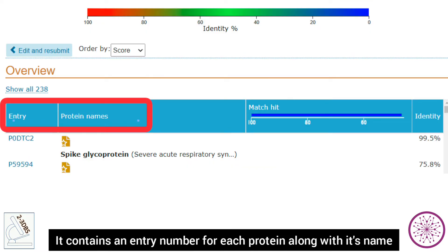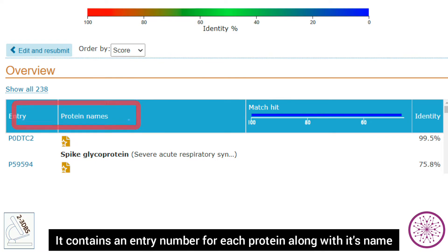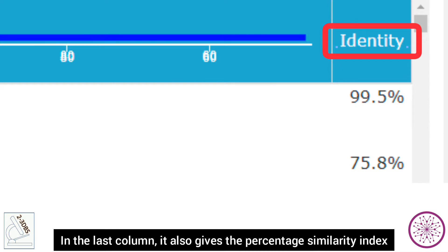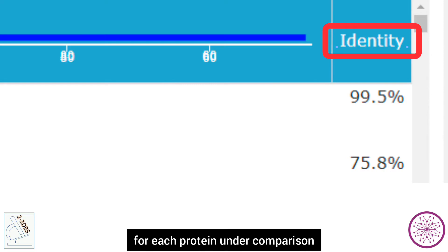The results page contains an entry number for each protein along with its name in the last column. It also gives the percentage similarity index for each protein under comparison.